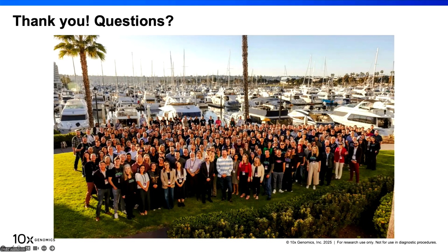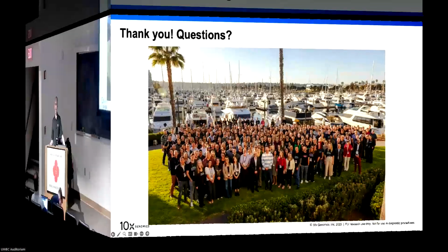Once you embed the sample in FFPE, that's stable for decades. We generated good Xenium data. Actually, we have a customer at the University of Cincinnati who generated really good Xenium data on 30-plus-year-old FFPE blocks, and those were pancreatic cancer samples. But that's because the sample at the beginning was, fortunately, handled really well, and blocks, as long as they're kept in a dry and cool environment, last for a very long time.